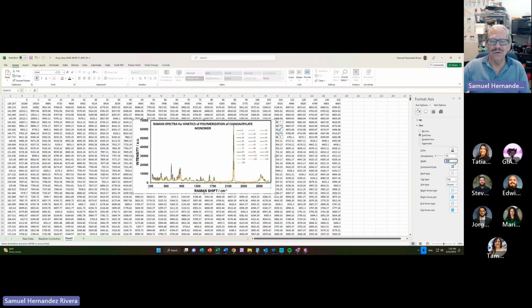It's looking great. I will do the same thing on the y-axis, but I won't spend so much time talking about what I'm doing.